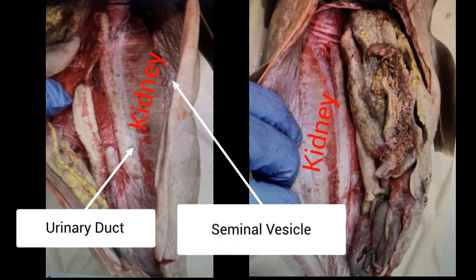Anatomy observations show that the shark kidney consists of a pair of kidneys that are located along the body cavity, ventral to the vertebra. The shark's kidney has an elongated shape, almost the entire length of the peritoneal cavity, and the inside part is brown in color. The shark's kidney consists of 3 parts, namely the anterior part, the head kidney, the medial part, the body kidney, and the posterior part, the tail kidney.